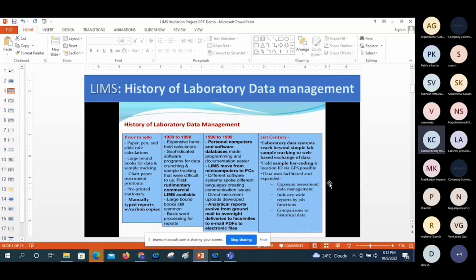Why? Because with paper-based systems, people can track only from a review and compliance point of view, and if any auditor comes for an on-site audit, at that time, if the data is available in the application, they can easily track and verify whatever data they require. For example, if they want to verify validation batches.